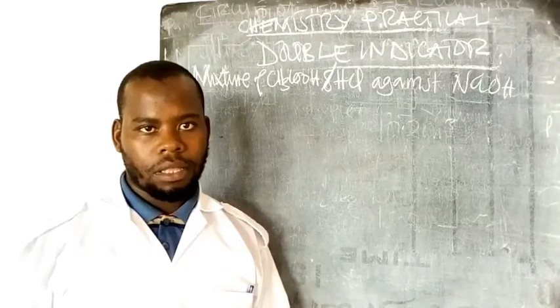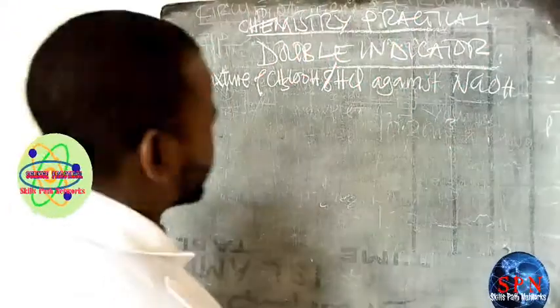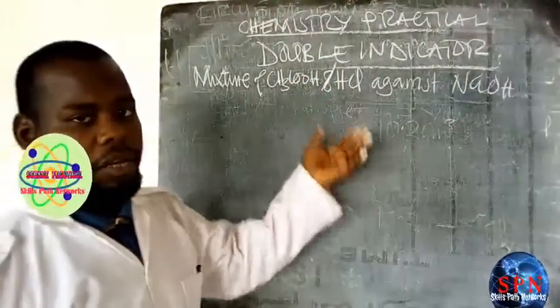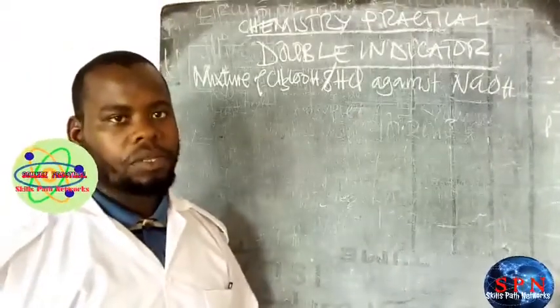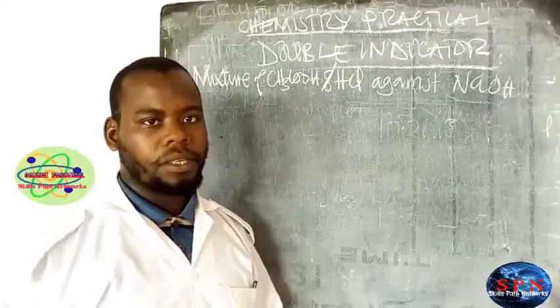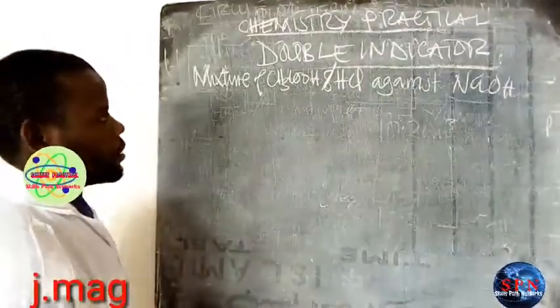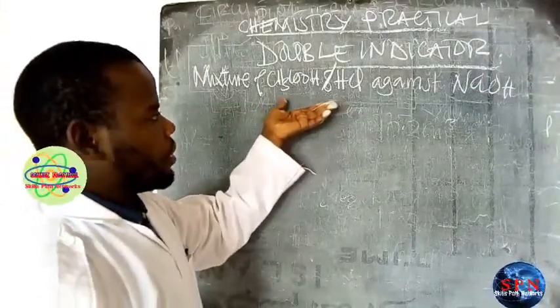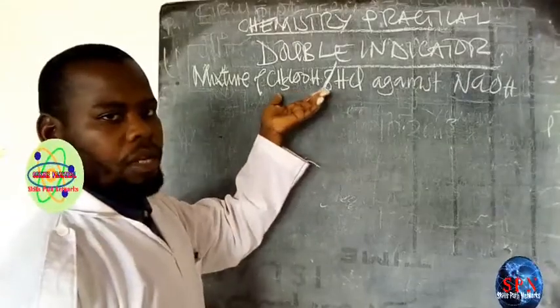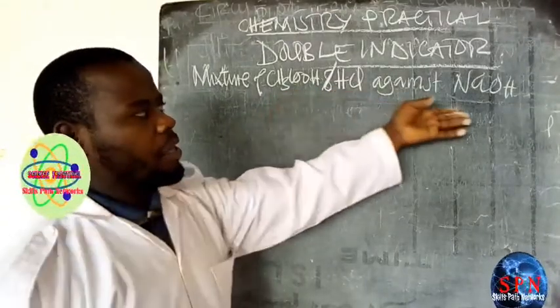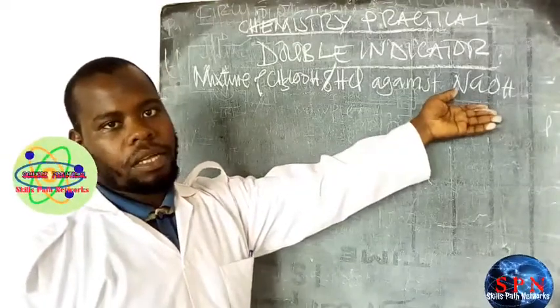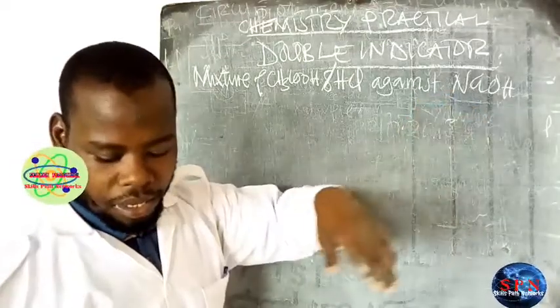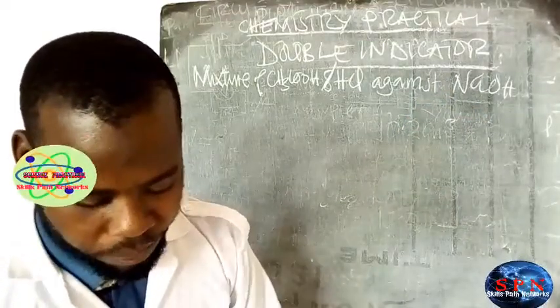We have a mixture of acids — acetic acid and hydrochloric acid — and we are going to titrate it with sodium hydroxide. This is another double indicator titration. The mixture will be in a conical flask and the sodium hydroxide will be in a burette.